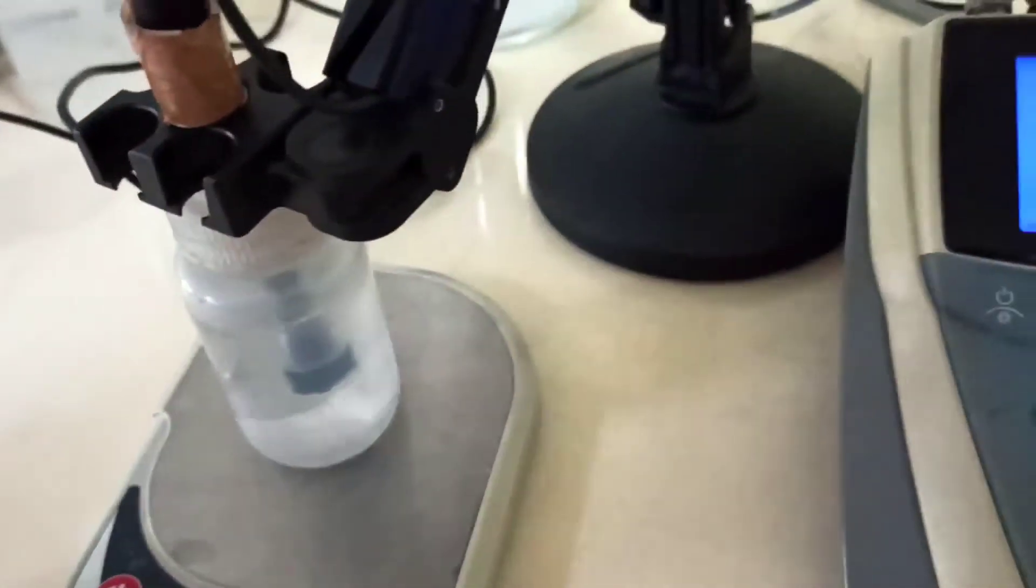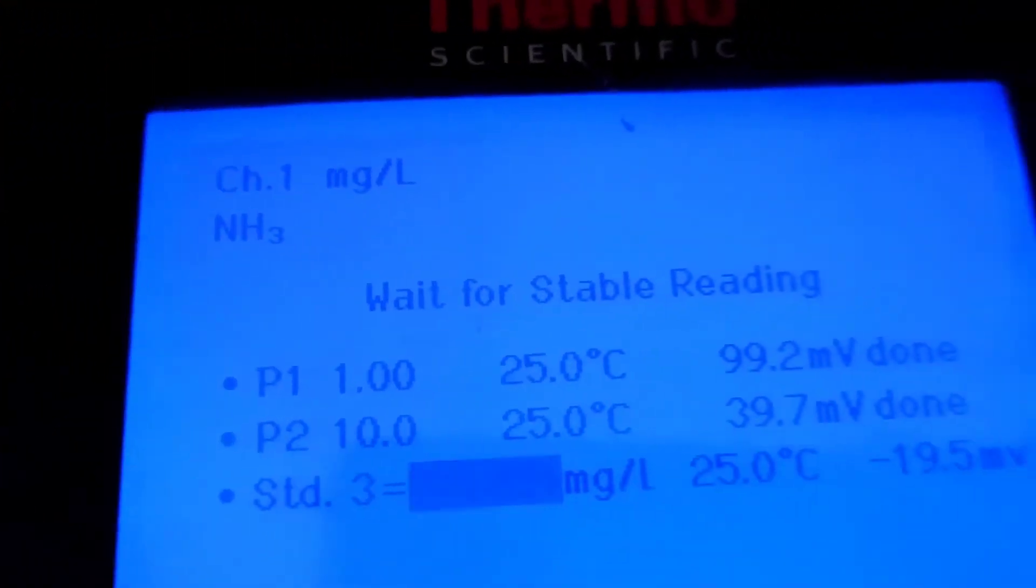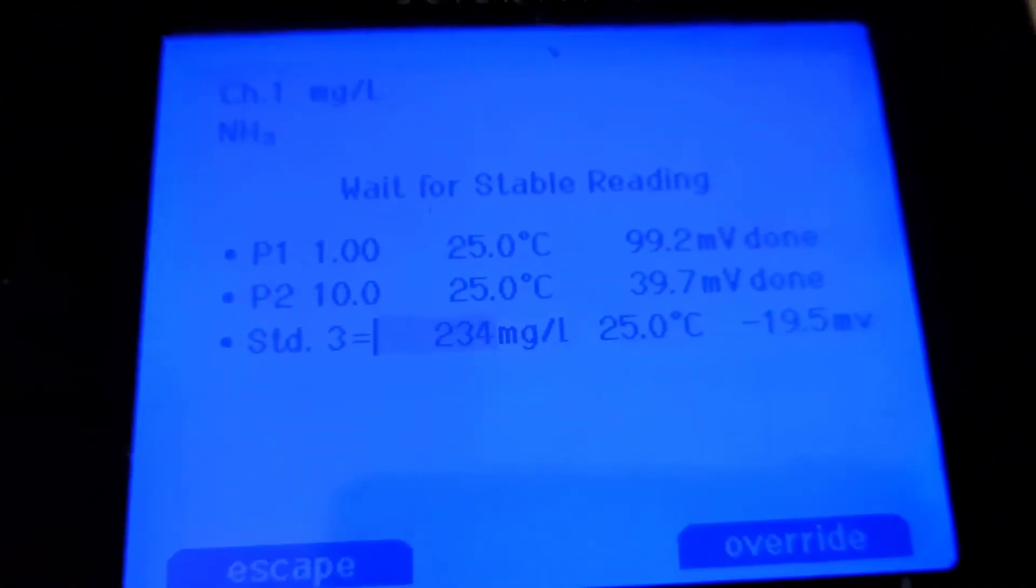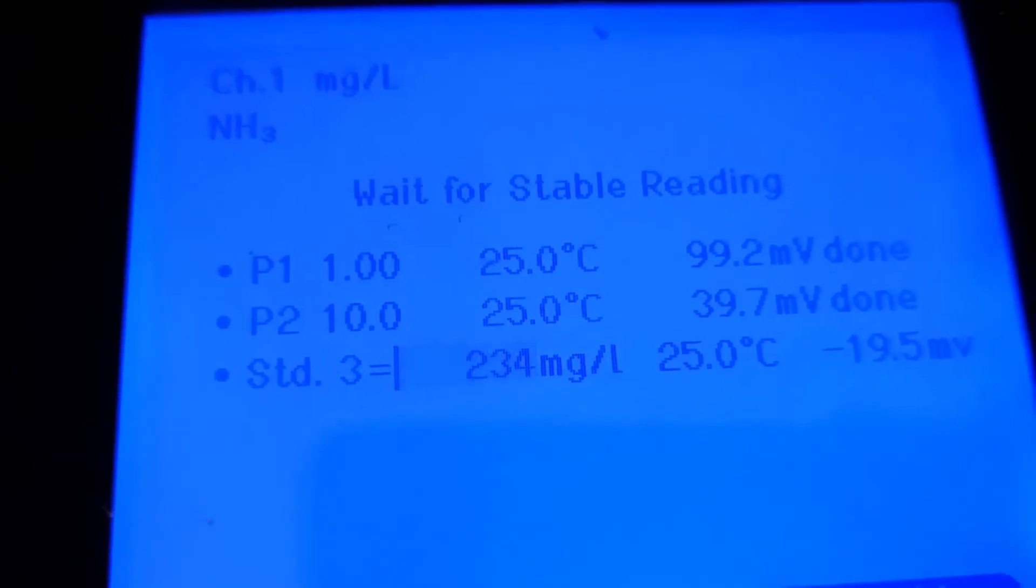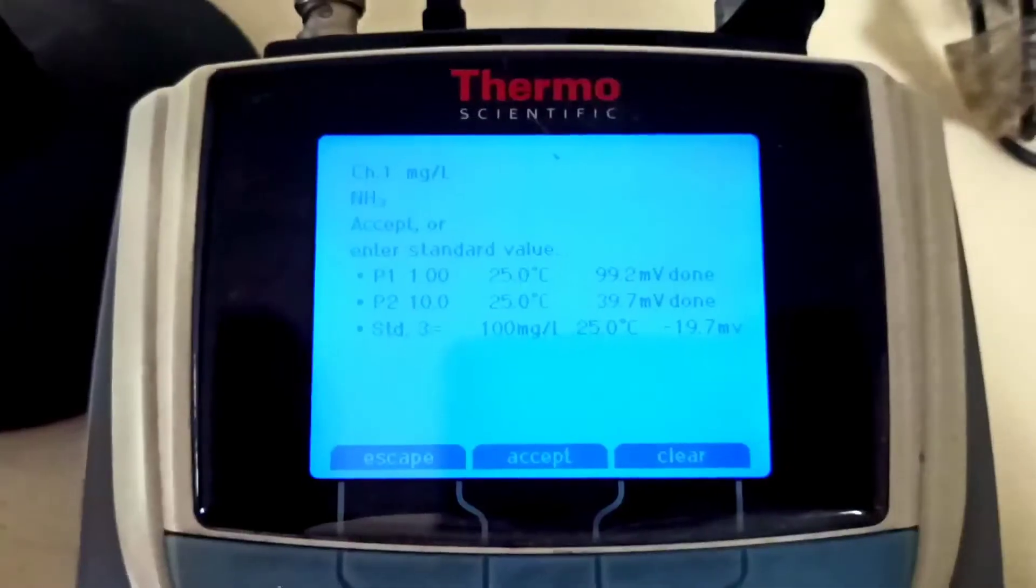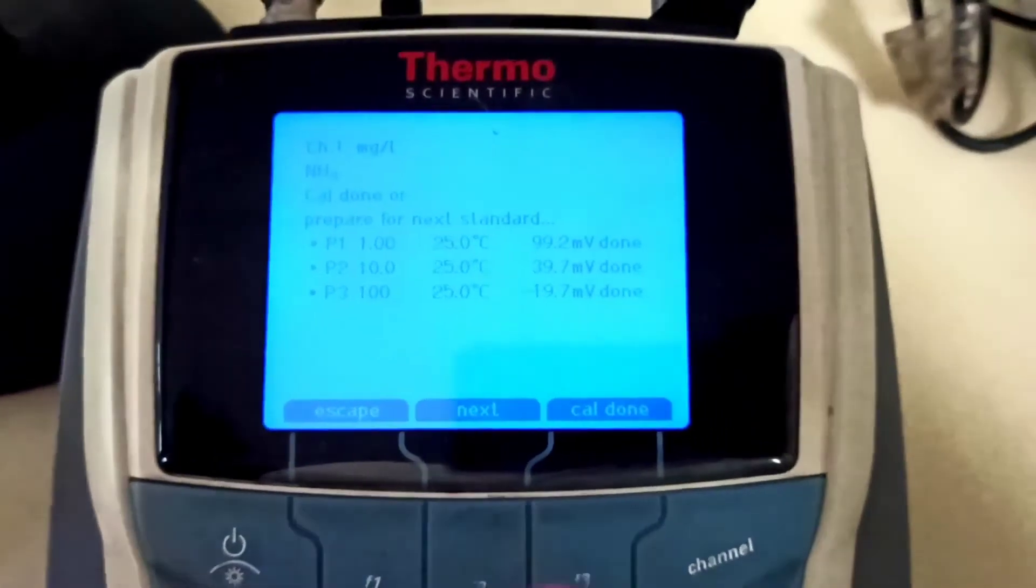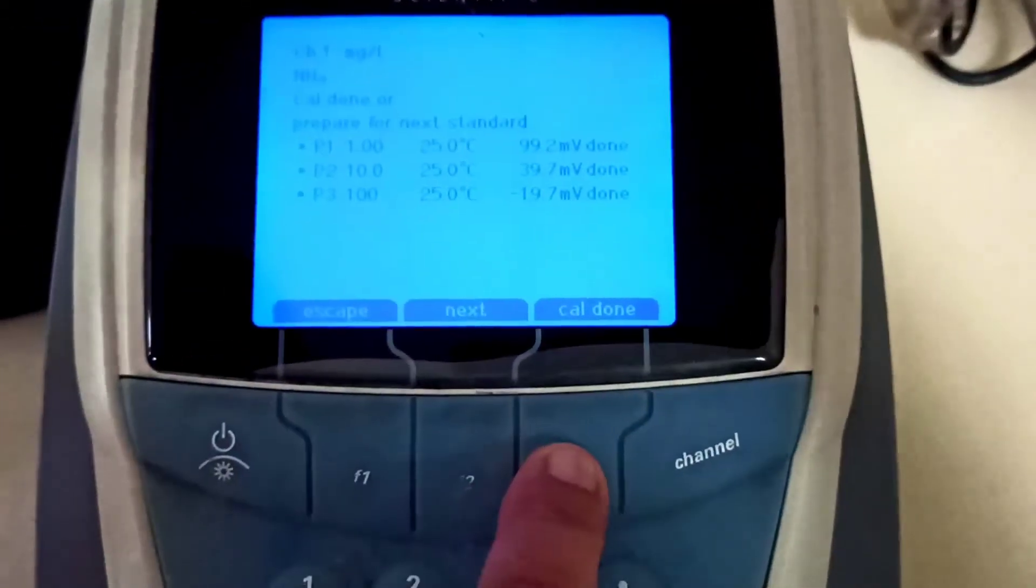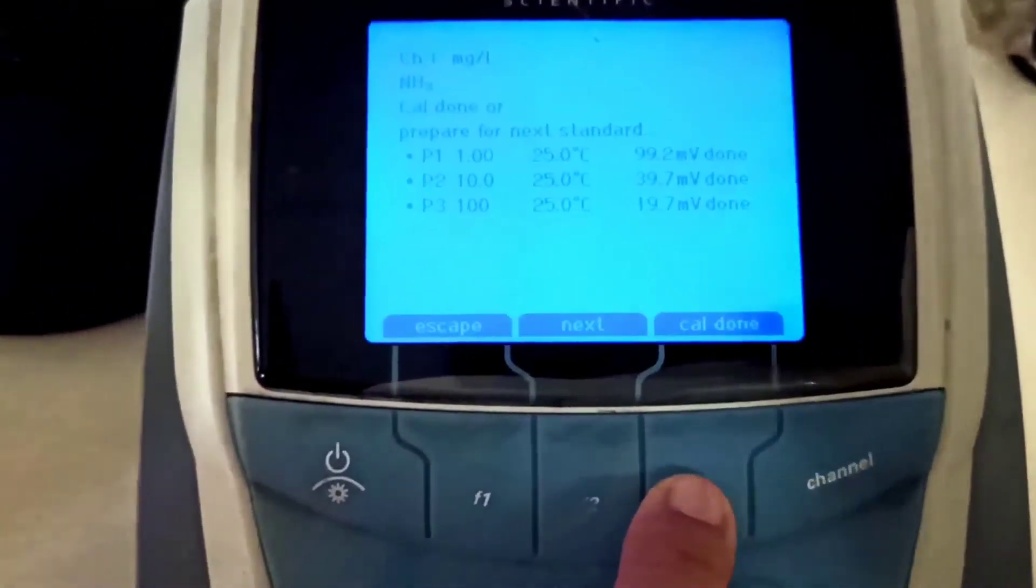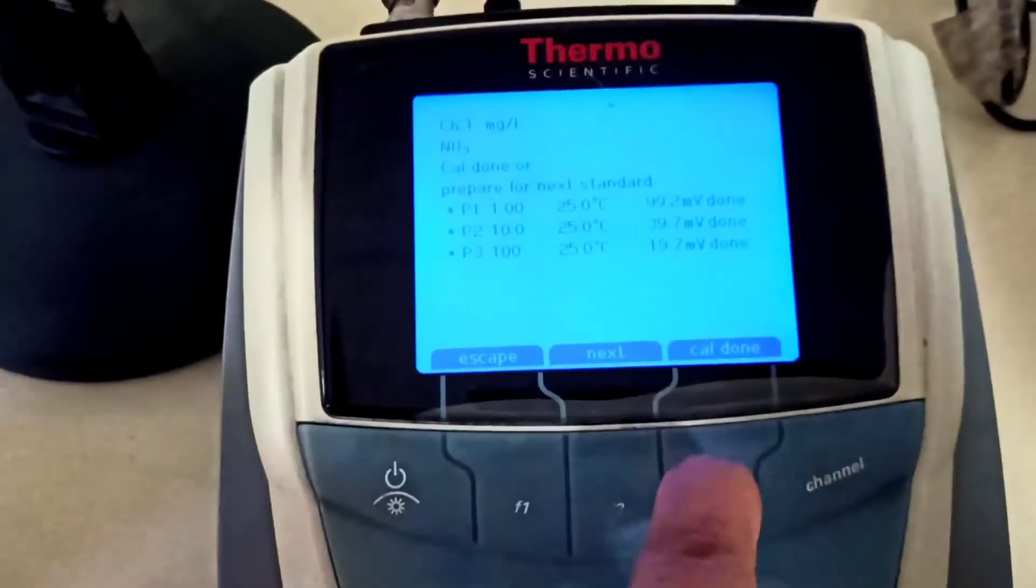Now move to the third standard. It takes too much time, 100 ppm. Now we get this result: minus 19.5 millivolt. We now overwrite and enter 100 ppm. We have taken three points and press F3 for calibration done.